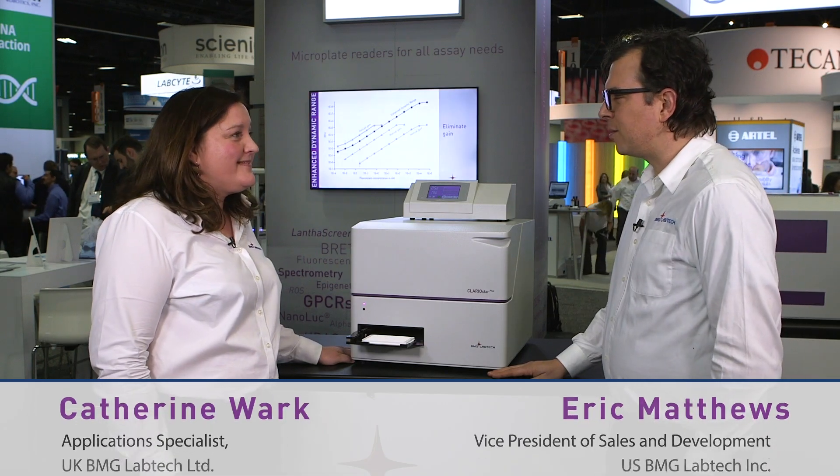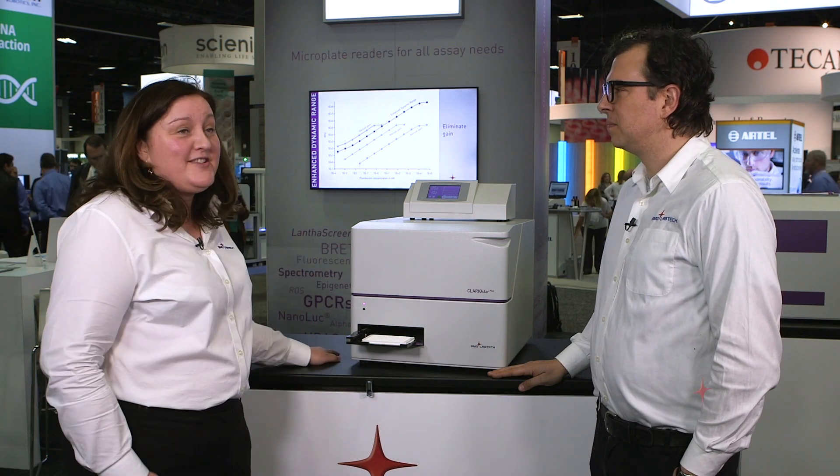Hi, we're with BMG Lab Tech. I'm Eric. I'm Catherine. Catherine, why are we here today? Well, Eric, we're here to introduce our brand new product, the Claristar Plus.